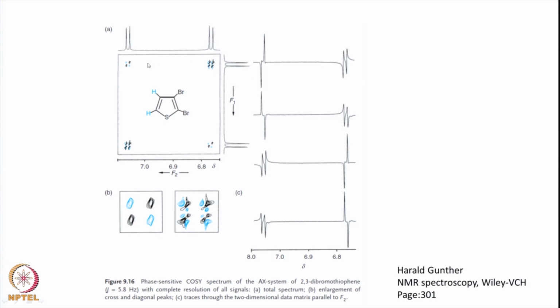Now you take the next one here. So what was negative here now becomes positive. So negative, positive, this is positive, negative, therefore this becomes positive and this one is negative, and this goes in this positive, positive fashion once more, and then here you have positive, negative, and positive, negative, both have the same sign. So now you come here, this is originating from the L spin. So you have now the dispersive components here, in this manner.